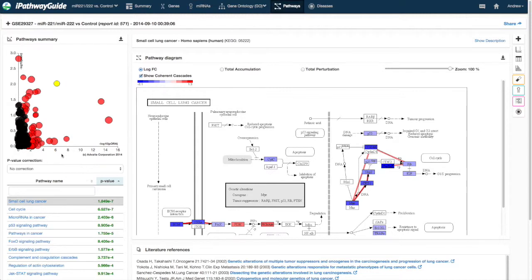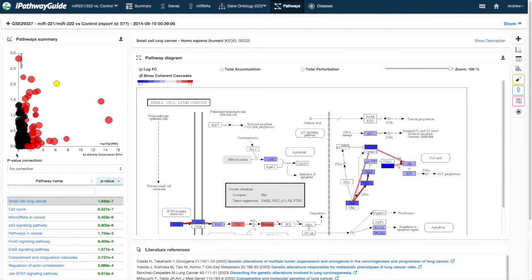The Evidence Plot has two axes representing different orthogonal approaches to scoring the significance of each pathway. The horizontal axis shows the inverse log of the p-value computed using overrepresentation analysis, or ORA.